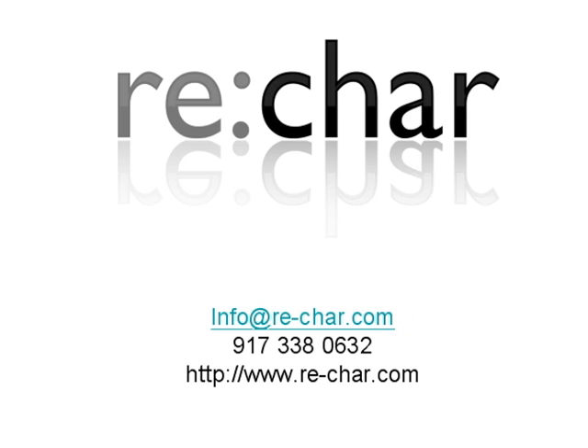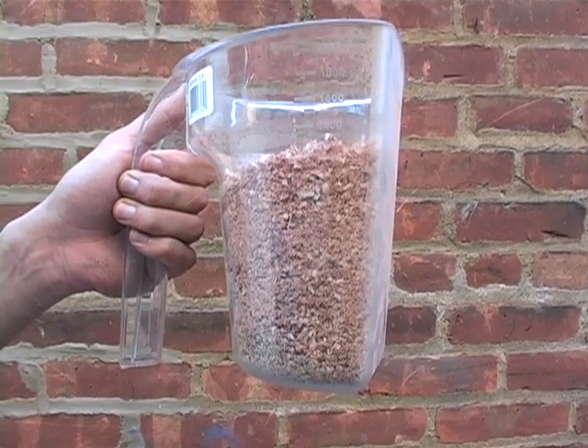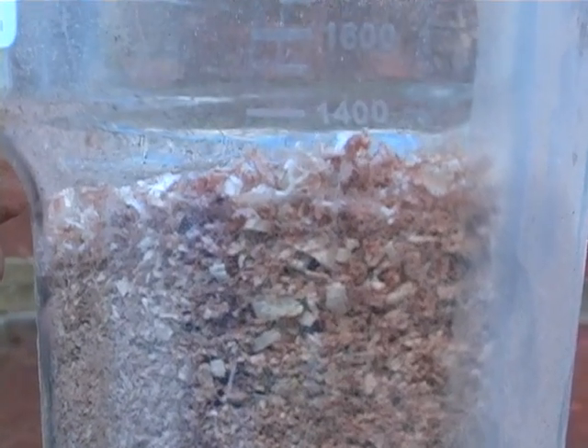In the following video, we demonstrate the process with one of our analytical pyrolyzers. In the first step, raw biomass is collected and fed into a hopper at the top of the pyrolyzer. In this case, we've used about a kilogram of wood chips mixed with sawdust.